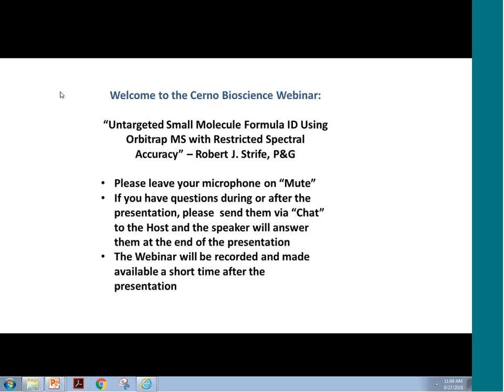Okay, well, thank you, John, for the opportunity to speak today and for that kind introduction. And of course, the topic centers on determining elemental compositions of organic compounds, a task that I suppose most of our attendees have faced at one point or another in their careers. In particular, we're going to be talking about a relatively new tool that I have called restricted spectral accuracy.